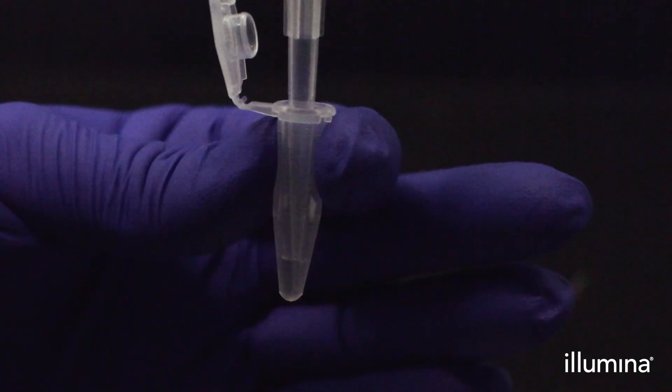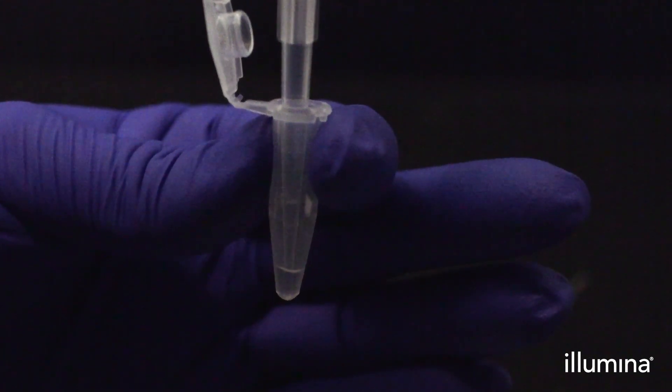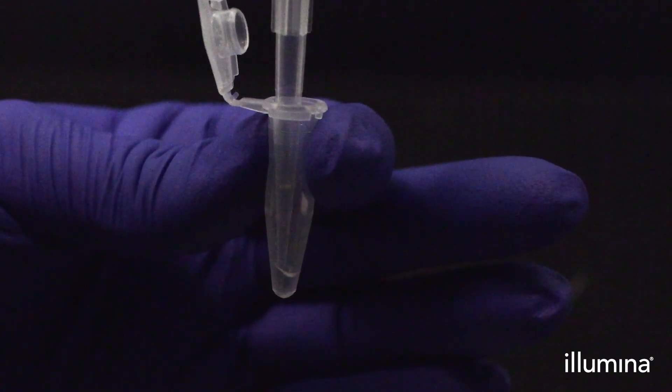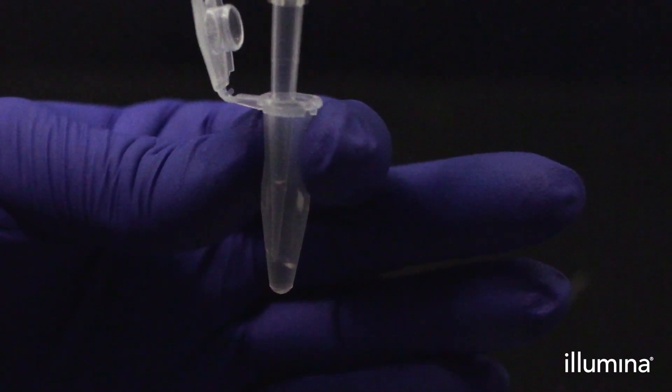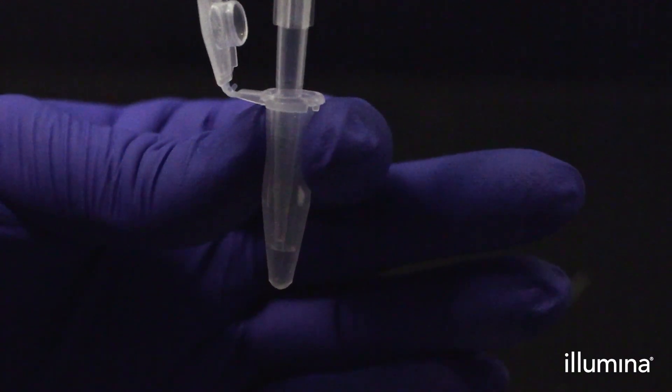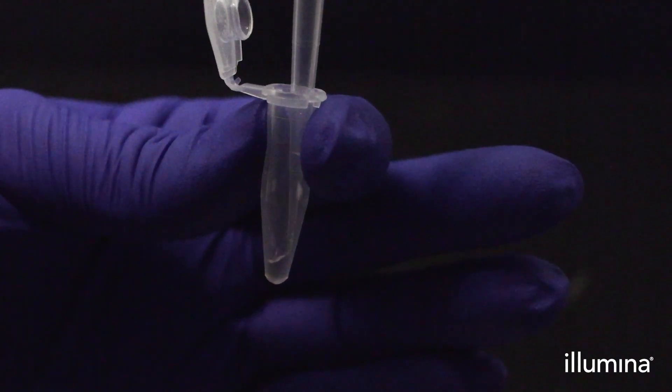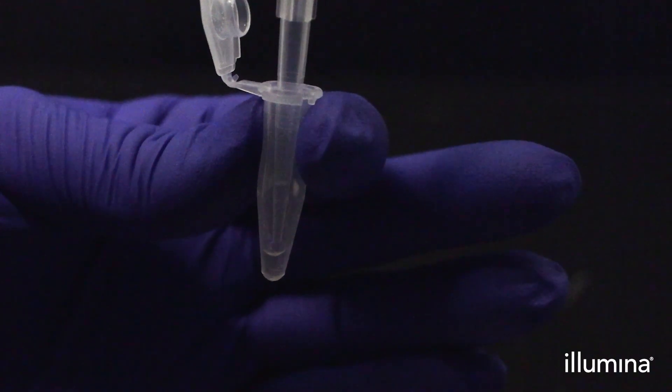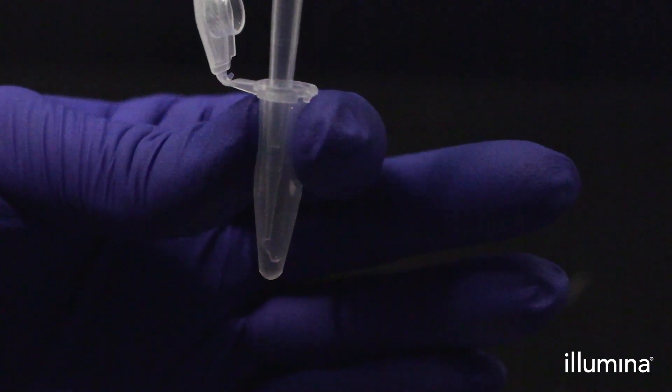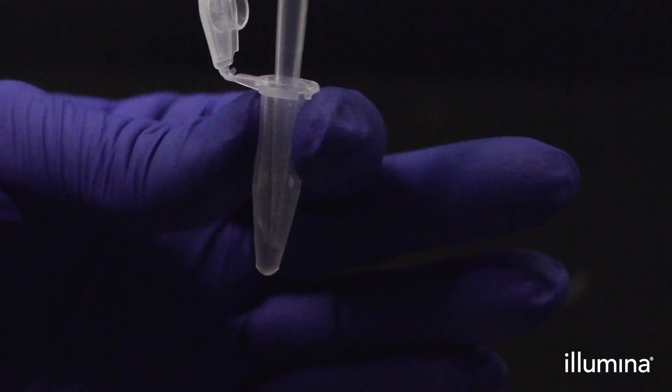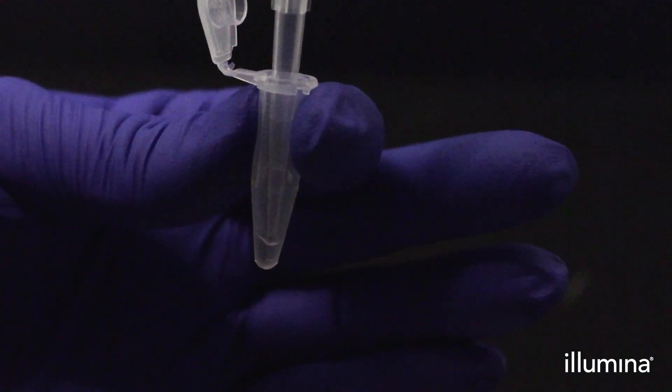Then, pipette mix each sample 10 times using a standard-bore low-retention P200 tip to ensure even dispersal of the sample. It is important to pipette slowly to the first stop only to avoid creating foam or excessive bubbles. This step should be completed with the pip tubes in the four-tube stand. We are not showing that here so proper mixing can be observed.